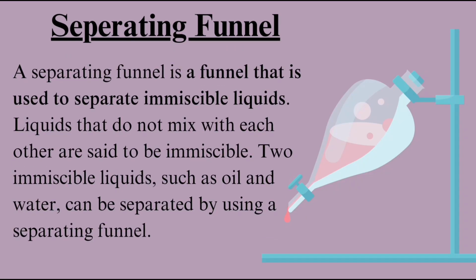Separating funnel. A separating funnel is a funnel that is used to separate immiscible liquids. Liquids that do not mix with each other are said to be immiscible. Two immiscible liquids, such as oil and water, can be separated by using a separating funnel.